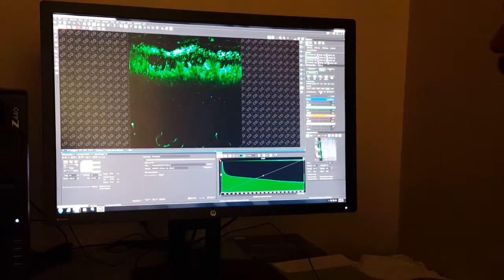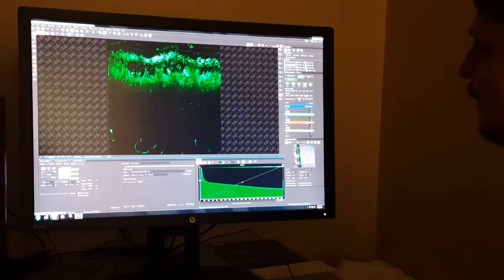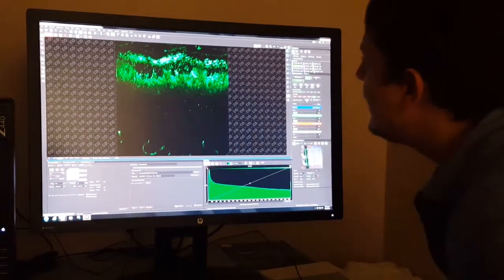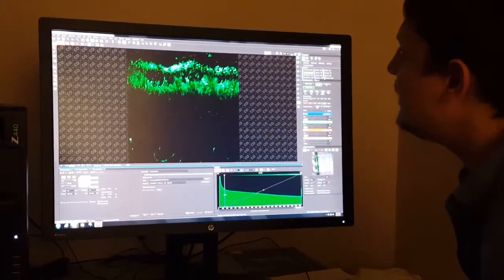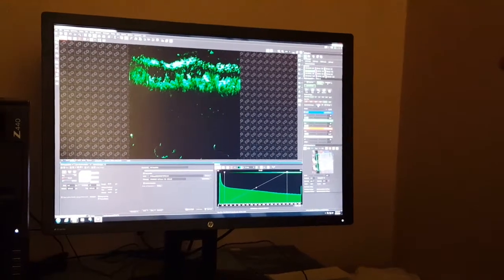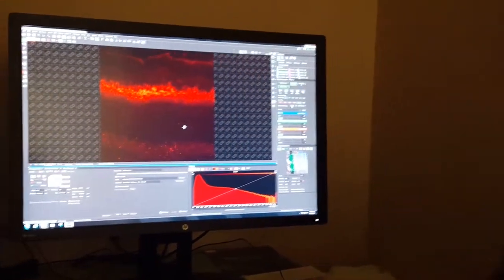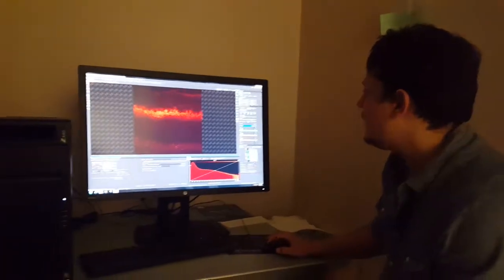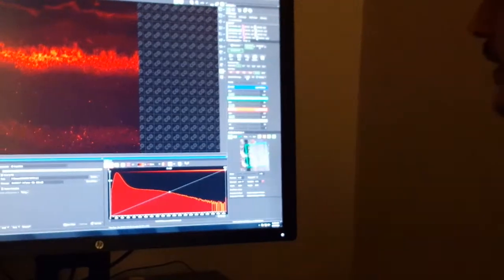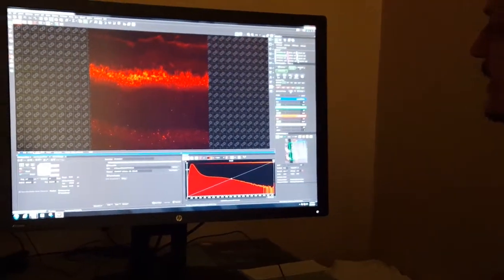This green is pretty clean also, and you can see that we have the entire spectrum full of that. So I can definitely take out, narrow down what is there, and excite a little bit. I will do exactly the same with red. In red we have a lot of background that we can see that is here, and also it's because we use a lot of gain and a lot of laser power, because the antibody is not that good, either the primary or the secondary.